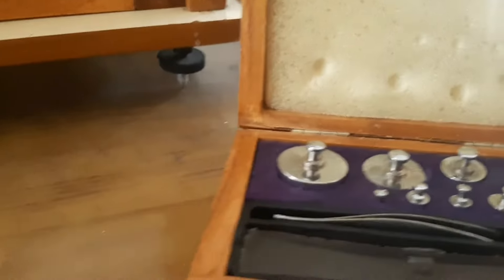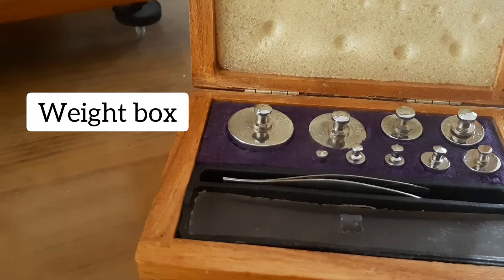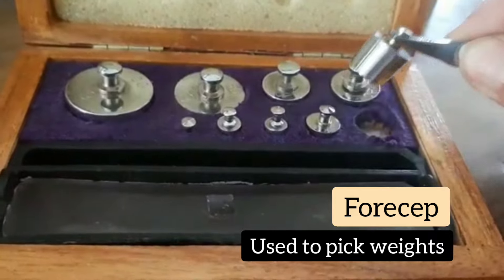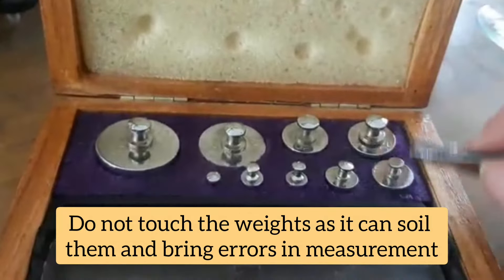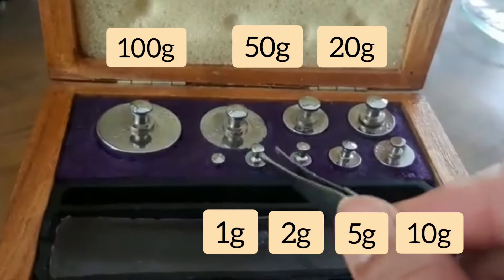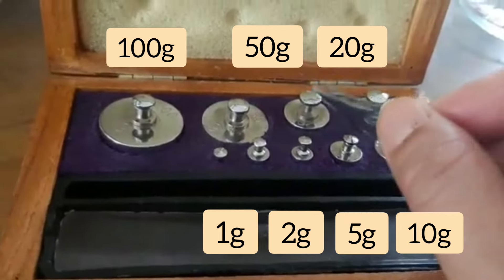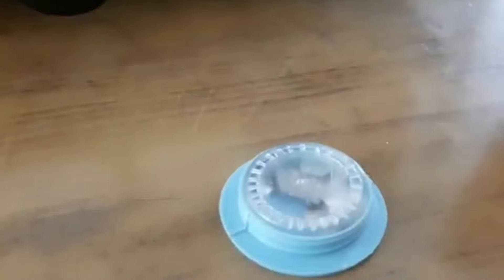For this I'm going to use this weight box. This forcep is used to pick up the weights — we should not touch the weights directly, as touching will soil them and affect their original weight. We have: 1 gram, 2 gram each, 5 gram, 10, 20, 50, and 100 gram weights, and then a fractional weight box.